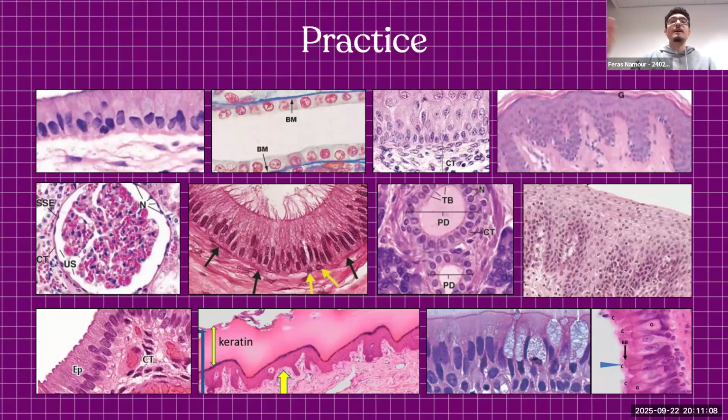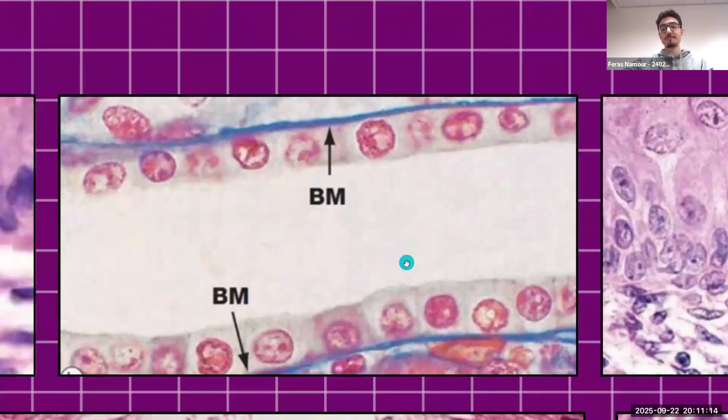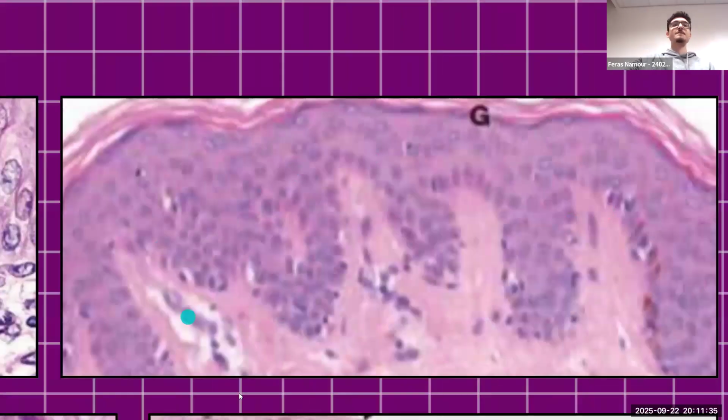All right, guys? Let's practice really quickly. Yalla, guys. Can someone tell me in the chat what kind of epithelium this is? I want you to give me the full name. Yalla, just a bit of interaction, and then we're gonna solve 3 together, and then I'm gonna solve the rest myself, so we don't take a lot of your time. Simple cuboidal, perfect.